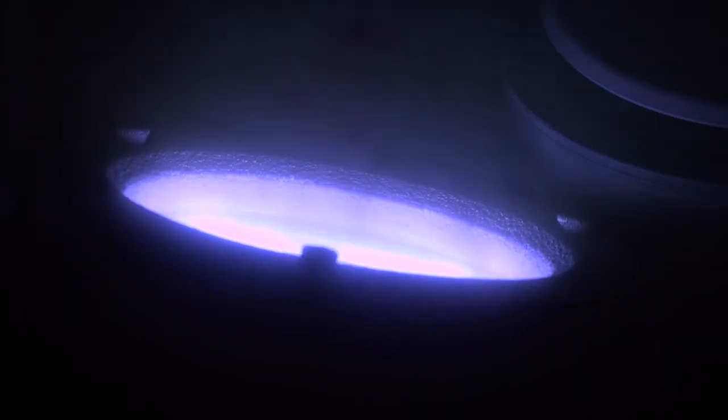Here, we are looking into the chamber at the plasma. The shutter is currently closed. We are now ready to open it and begin deposition. With the shutter now open, we are depositing titanium atoms onto our sample located at the top of the chamber. We can monitor the thickness using the thickness monitor. When we reach our desired thickness, we will close the shutter to halt deposition.